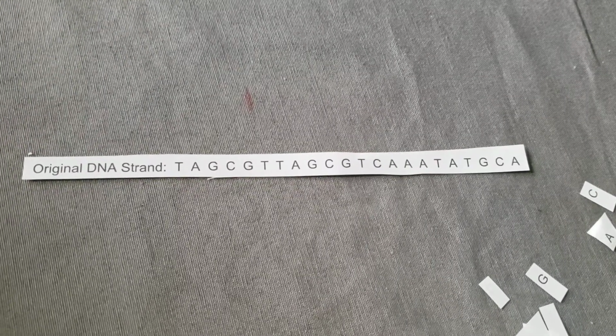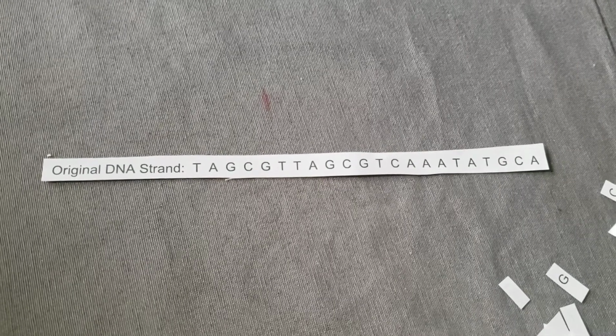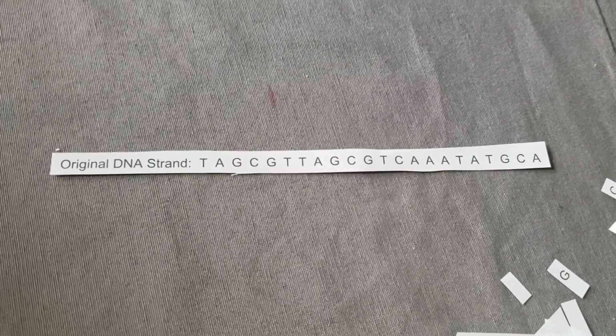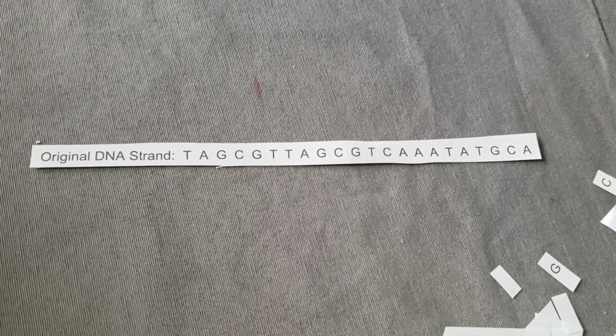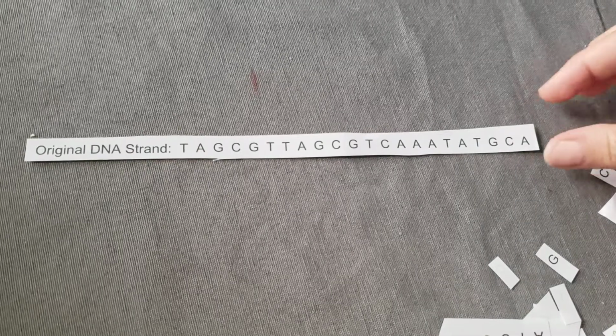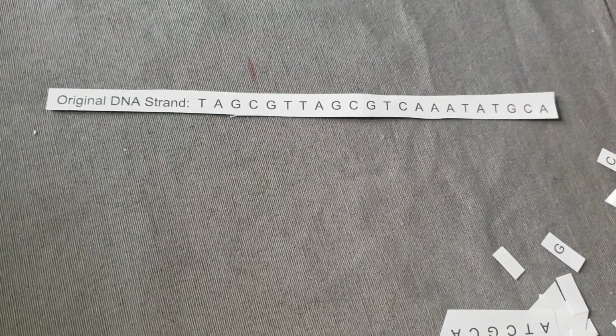Okay, so this is the video that I would have liked to have shared with you all earlier during our class. This video is going to explain a bit about using the PCR process to help with DNA cycle sequencing. So let's say we are starting with an unknown sequence of DNA.